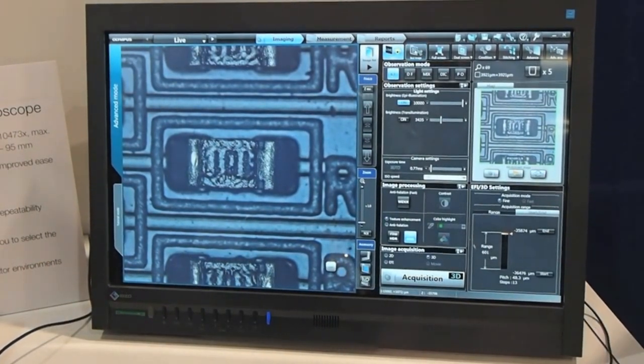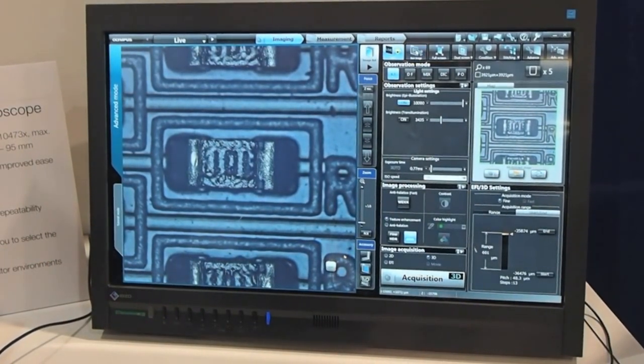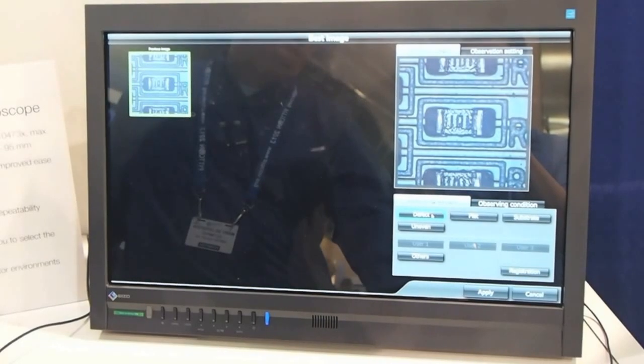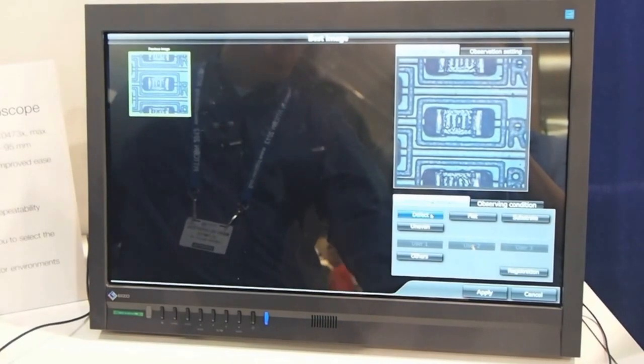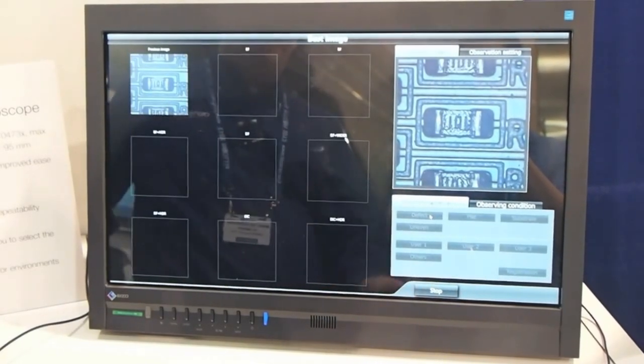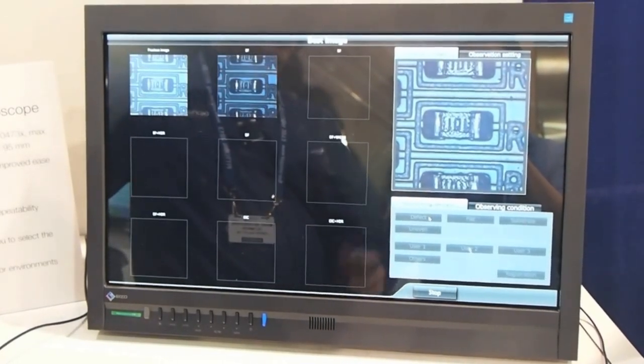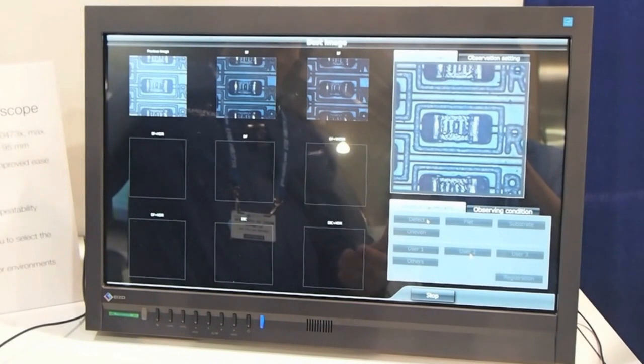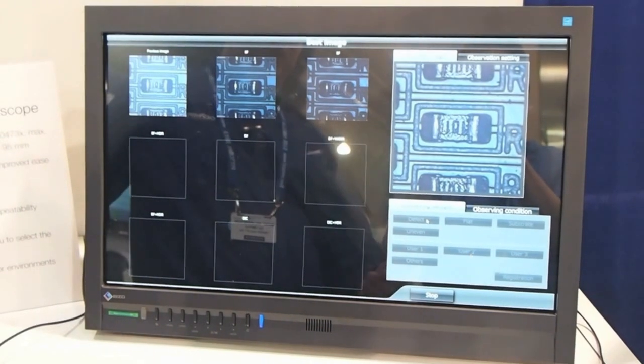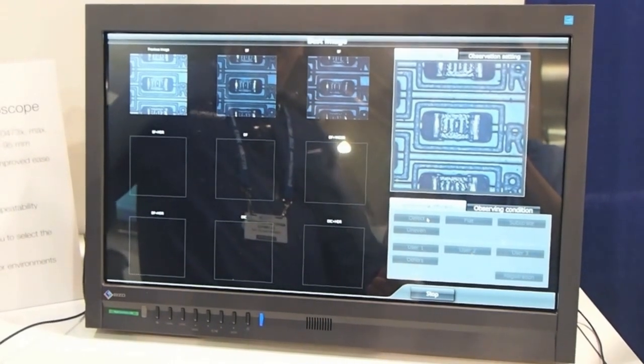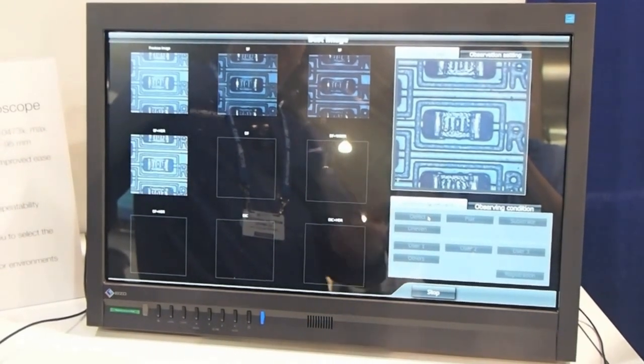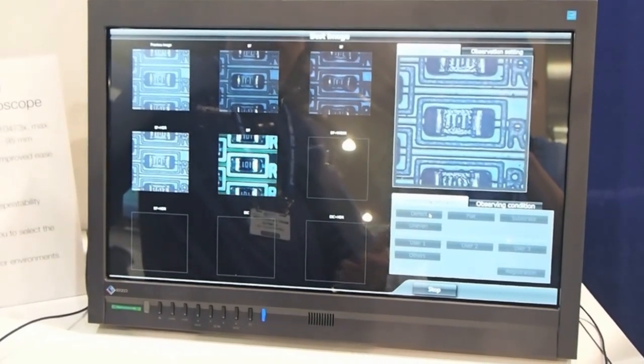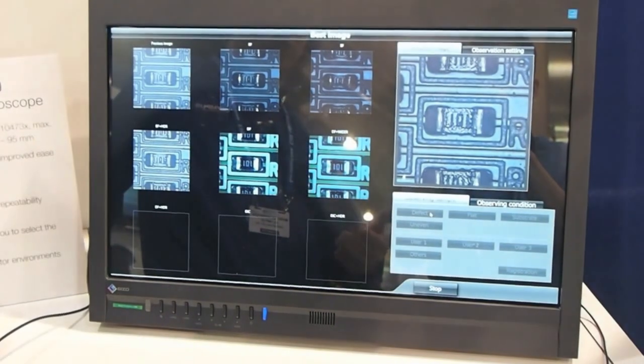We select best image and by picking a predetermined mode such as defect, the microscope cycles through different options: bright field with different settings, bright field with high dynamic range, and dark field.